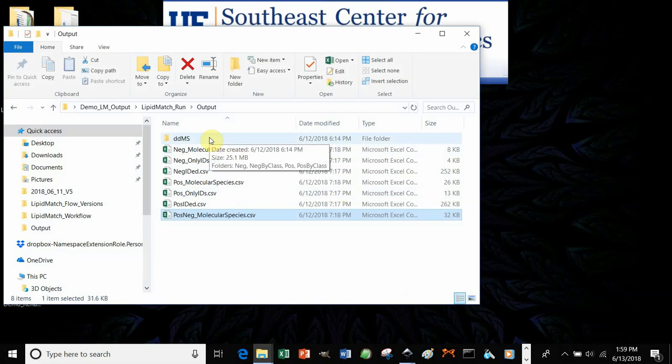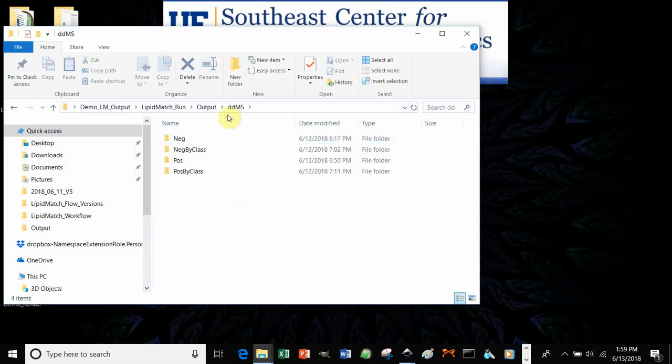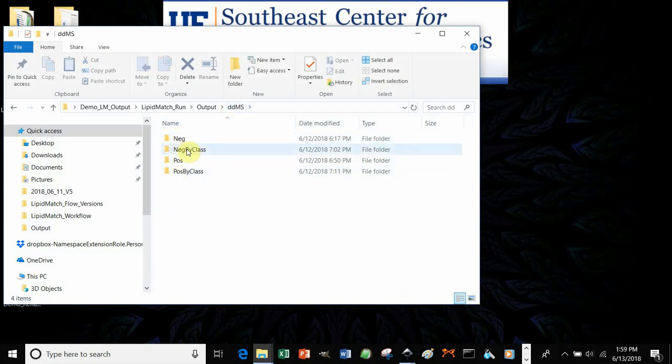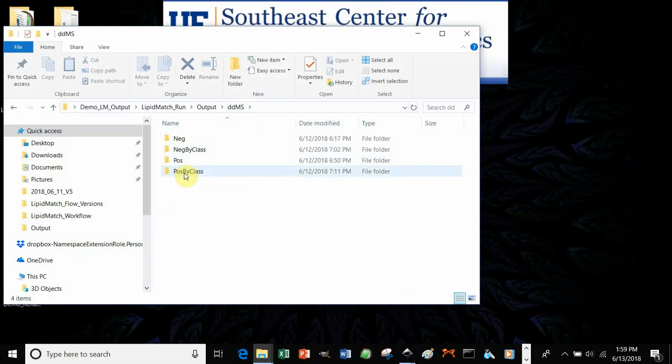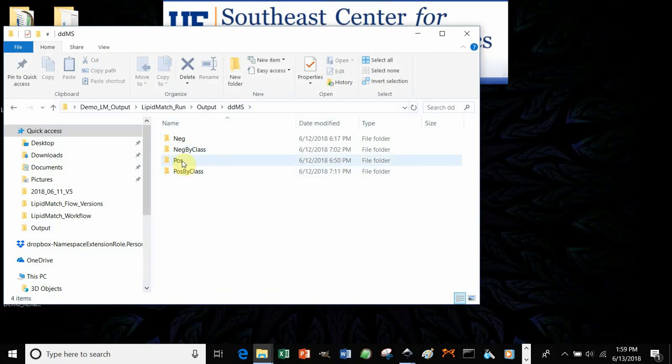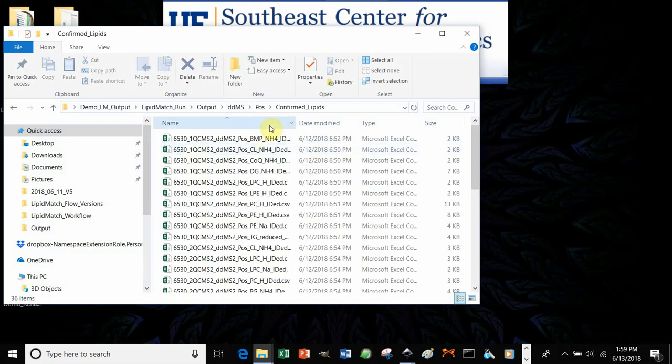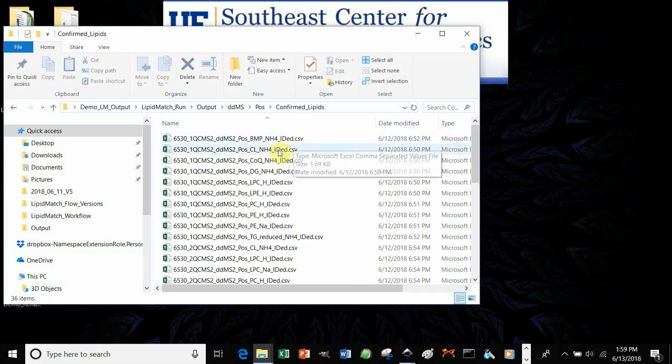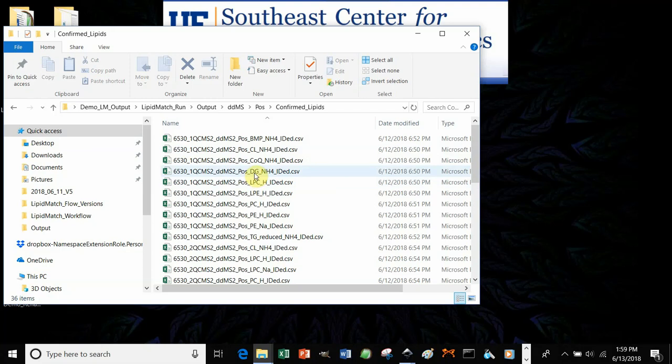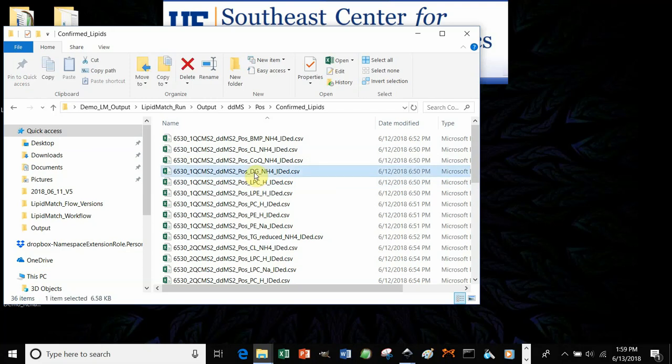Now I'll just go over some additional files that you can get. So if you go into your data-dependent folder, you have your neg, ones only confirmed by class in negative ion mode, ones in positive ion mode, and only confirmed by class in positive ion mode. If you go to positive, confirm lipids, and let's say we want to look at DGs, and there are certain DGs we want to know how they were identified. We can double-click this file.